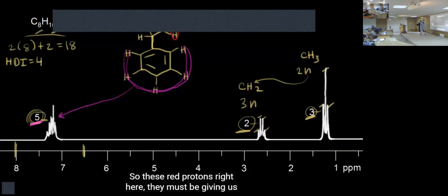But since there is no substituent, in the current condition this proton is ortho-coupled to this and meta-coupled to this, right? Ortho coupling and meta coupling. So each proton is ortho-coupled and meta-coupled with the other one.